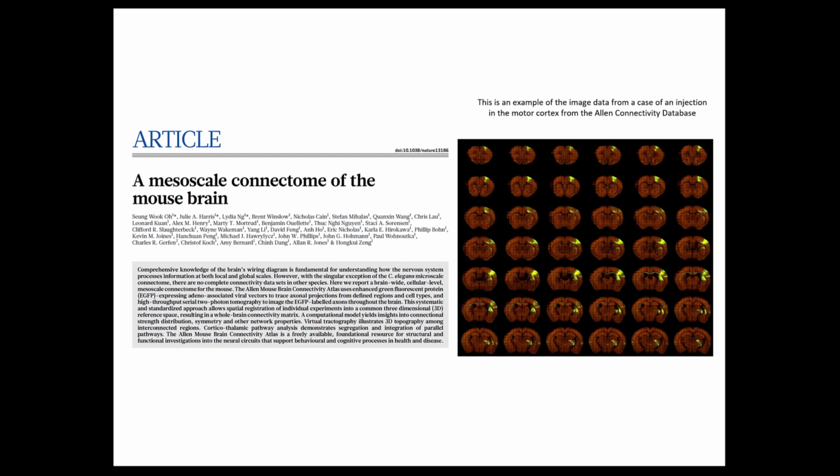The major advantage of this was that they took individual brains that were coronal sections, and you can see this is one of the brains that they did, and they made AAV viral injections into the cortex, and mapped the projections through the whole brain, doing every section, and then they registered these sections to a common atlas.